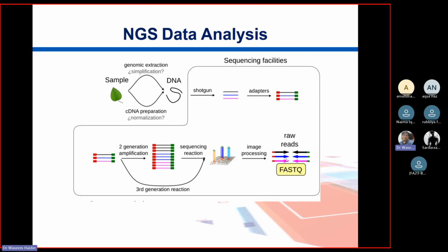So here we are seeing the pairs of reads. One is the forward and one is the reverse. So basically it's paired-end data, and we can see those red and green dots, the things we attached here, the adapters. They are also present here up till this stage, and you remove them in the QC and filtration step, right? FASTQ is the format in which this data appears, right?